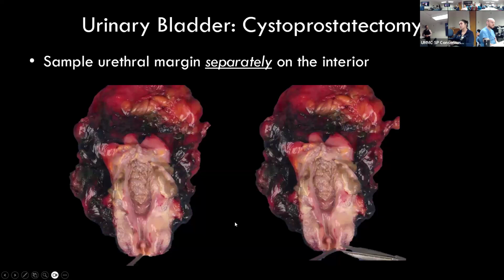So here, point to notice, what is actually the urothelial mucosa? You can see the color over here in the prostatic stroma. So that is all stroma. So it's sort of pale white. In contrast, look at the urothelium, the membrane. It's shiny, slightly yellowish.